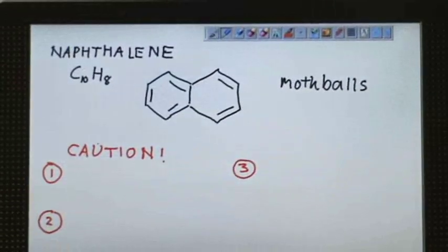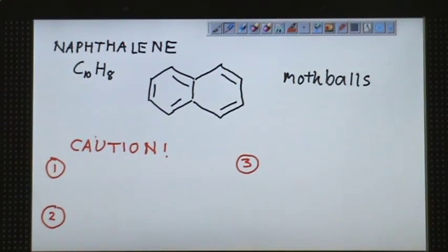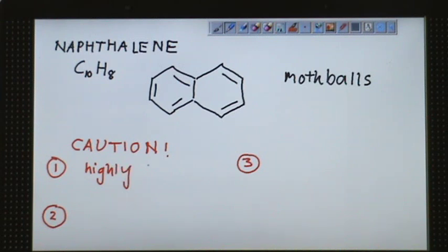Now we want to do some heating and cooling of this substance. Before we begin, we need to take a few precautionary steps. Number one, naphthalene is highly flammable, so we cannot heat up naphthalene directly with Bunsen burner. Instead, we should heat it with water bath.